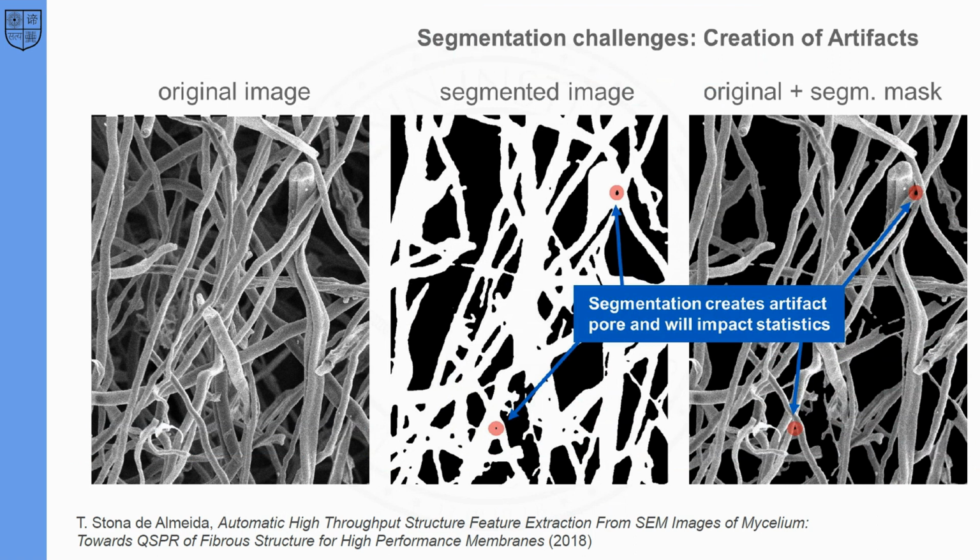Now we should note that the mycelium network is a three-dimensional mesh that ideally should be characterized with a tomography type of method that can actually capture all three dimensions. That is not what scanning electron micrographs can give us. So this study is already limited by the two-dimensional nature of the images. Also, estimating depth in a SEM micrograph can be challenging, since depth is not related to intensity of light in the image.